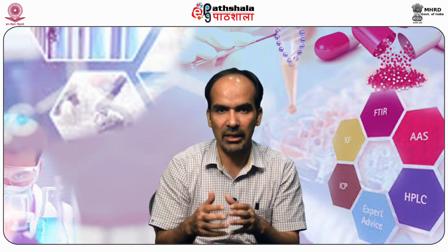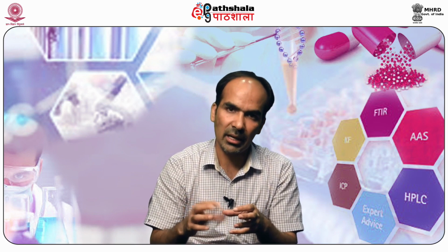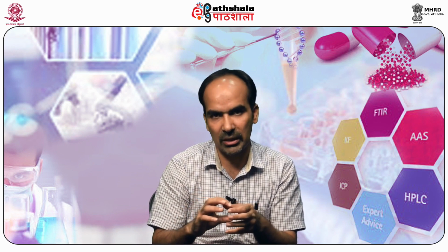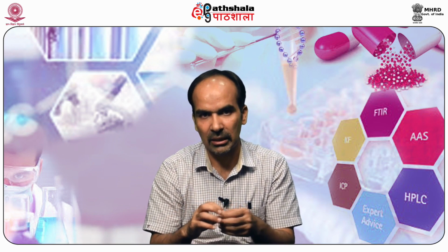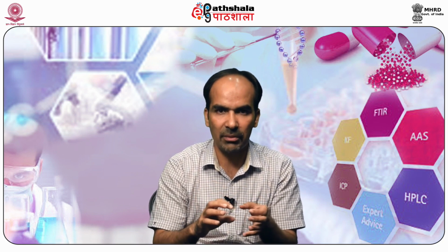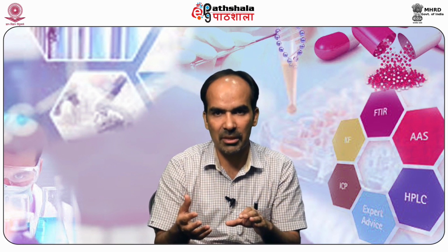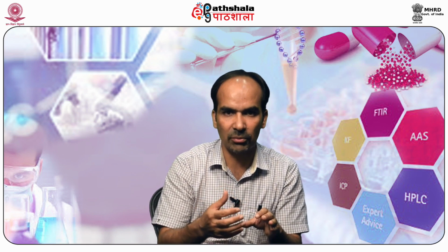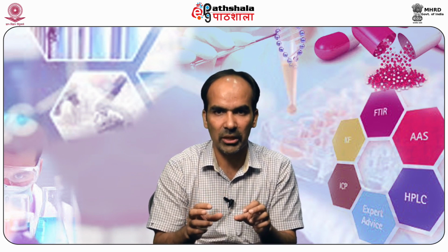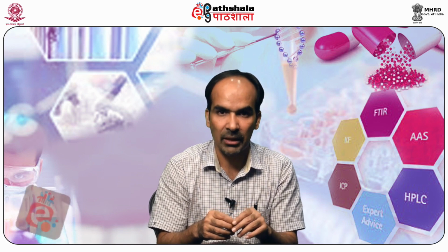Another thing that has particularly affected the way we do the spectroscopic evaluation of natural products is near IR spectroscopy. With the help of near IR spectroscopy, fingerprints can be developed which can be used along with chemometric techniques. They can be used to know the compositional characteristics and variations in plants or plant products.